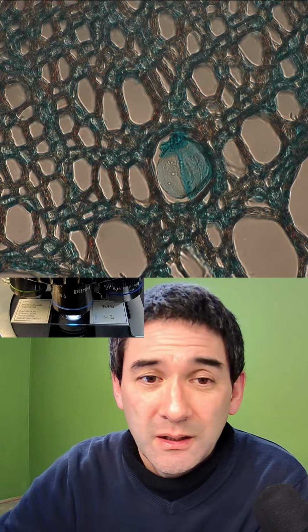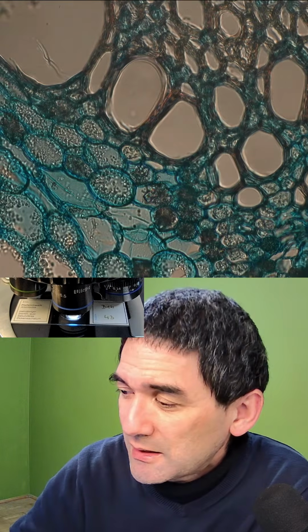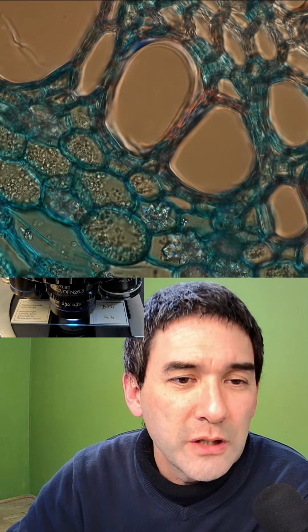So, are they really crystals? I don't know. It could be. It does look like it. Let's try it again. You see, usually if something starts to light up like this, okay. But I want to show you something else here. I do have some other slides that look very much like crystals, but I don't know which ones they are or what they are. Look. If something lights up like this and has so many sharp corners, this is a strong indicator that this might be some kind of a crystal.